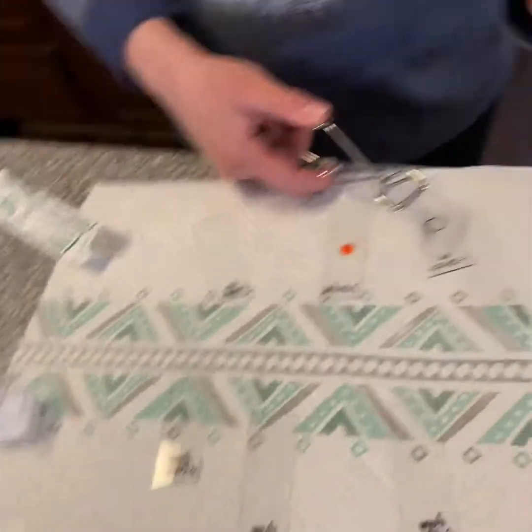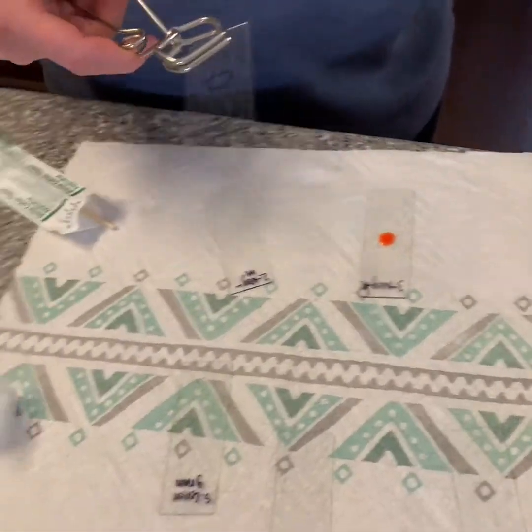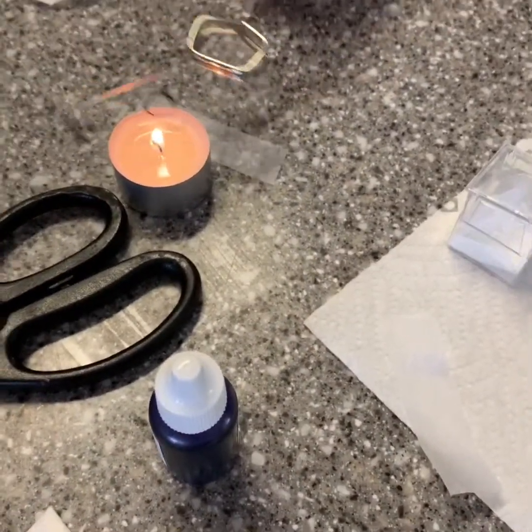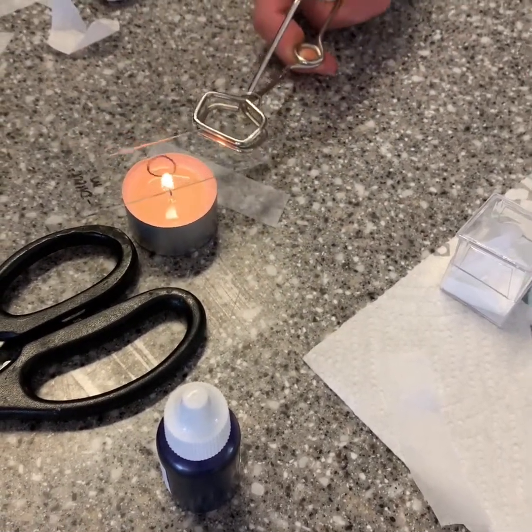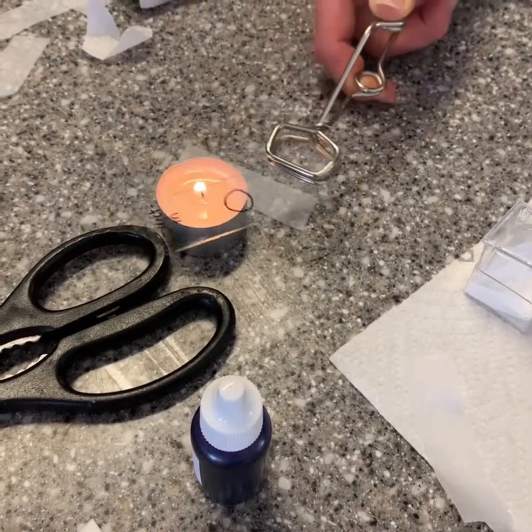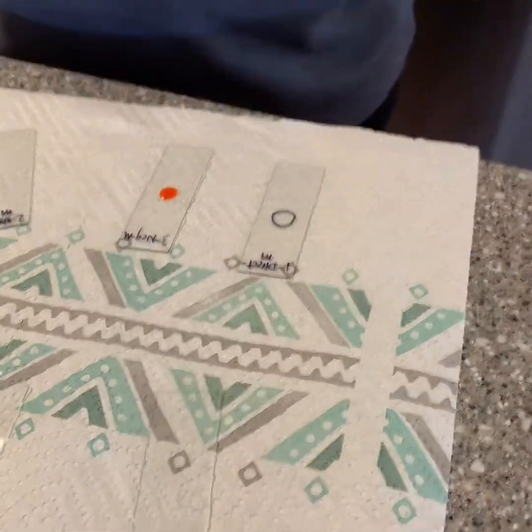I have swabbed my mouth and I have placed it on this slide and now I'm going to heat fix it. I have my flame right here. I'm passing it over five times or something like that and I'm going to let that completely dry.